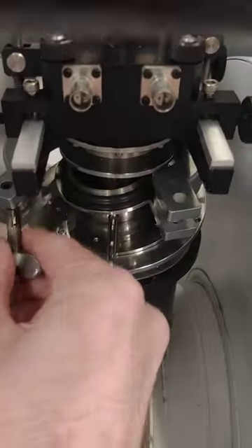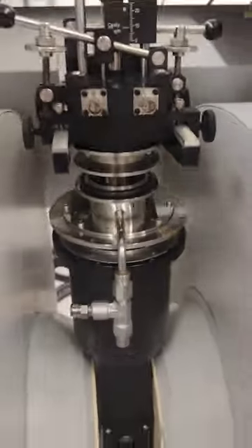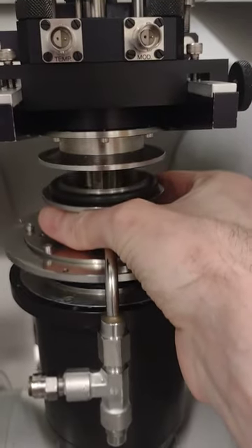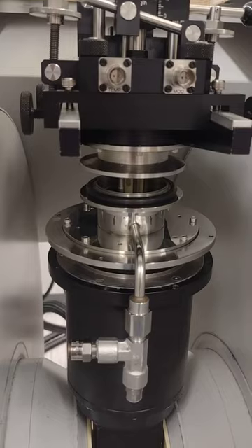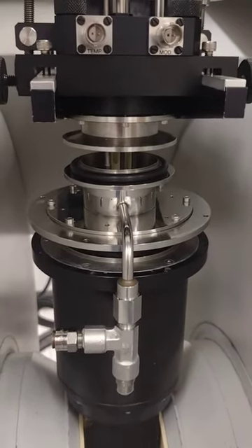You'll also want to loosen this clamp. Once you loosen it, this will drop away. As you can see here, we have the accordion-like bellows. That allows it to flex whenever there's high or low gas pressure inside the cryostat.